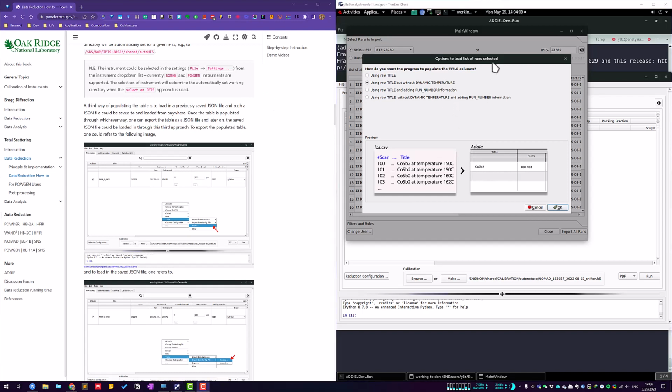So the idea is that during the experiment, we will, in most cases, have multiple repeated runs for the same set of sample measurements, just to accumulate statistics. And later on, for the same set of measurements, we have multiple run numbers. So for sure, we need to merge them. And we have multiple criteria we can use to merge the different runs.